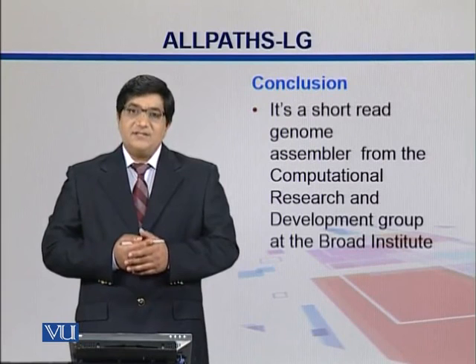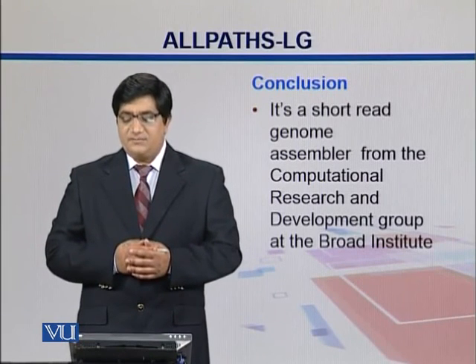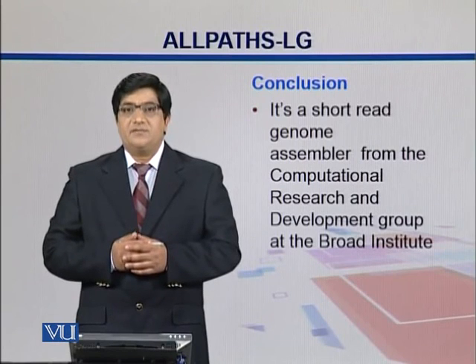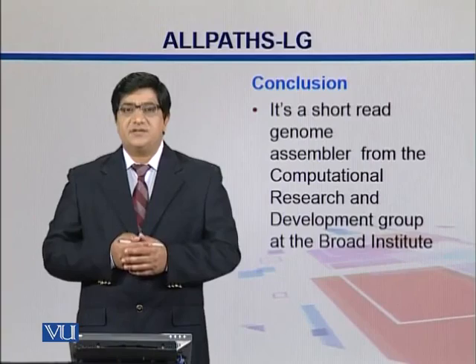So what is ALLPATHS-LG? In this section we have seen that it is a short read genome assembler from the Computational Research and Development Group at the Broad Institute, and we can use it with different coverages, as we have seen in this section.